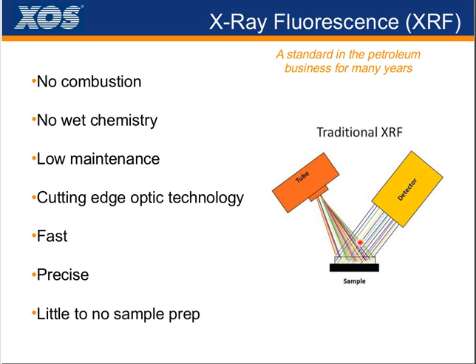So what's happening there is, if you remember your atom model, when you had electrons and the little valences around the atom, these electrons start to move, and they shift from one valence, one ring, to another ring. And when they do that, there's an energy that gets released. And so when that energy is released to move them from ring to ring, there's a detector on the back end that's picking up that energy.